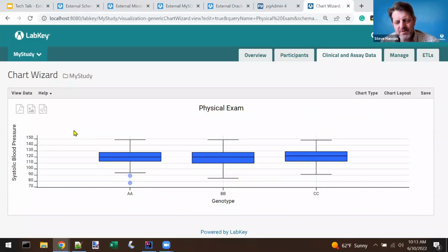Yeah, the Tableau demo is really great to see. Do you know what edition of LabKey supports the ODBC driver? You can also do a JDBC type of connection, but I don't think it's in Community. I don't know which edition it is. I'm not sure either. But I do know that what we're showing today is in the community edition. Another thing to keep in mind is that not only is this an incredibly powerful technique, it's in the community edition. It's amazing.